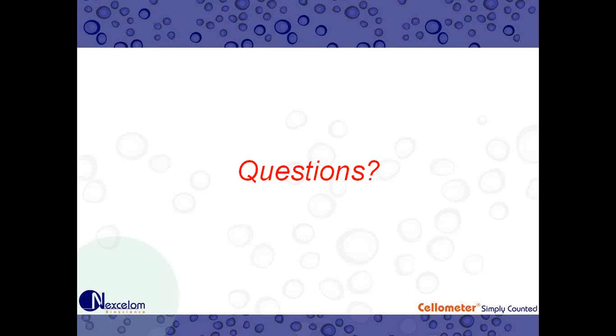I've seen it work well at 3 minutes, at 5 minutes, at 7 minutes. It might just be that the AO has not had enough time to bind to the DNA inside the yeast cells. So trying a time course study and seeing how that affects the signal would be a good start. And then you can always contact me. If you have internet access, we can do a remote desktop session. If that does not work, we can support you to get it to look better for you.